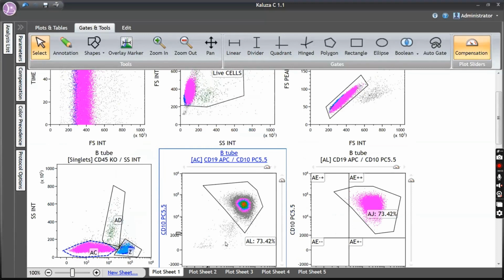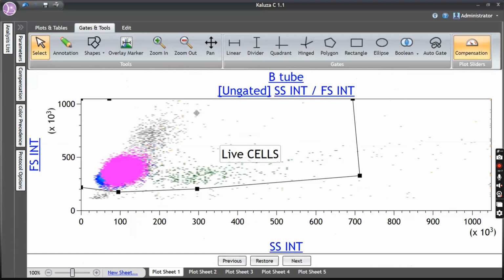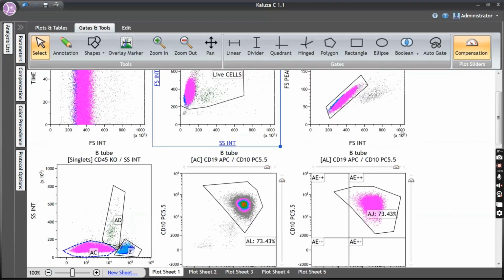Okay. Yeah, there was one more doubt. Yes, please. If it is a myeloid blast, then we should take granulocytes as controls. Yes, of course. You should take the side scatter population as your controls. Of course, lymphocytes will act as your negative control. Granulocytes will act as your positive control. Should I show you that? So shall we go for tube 2?